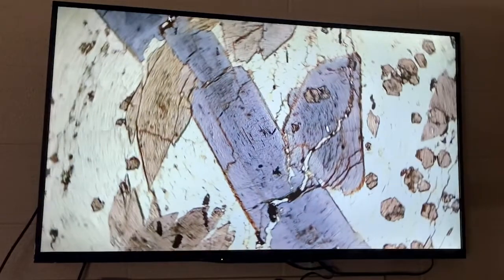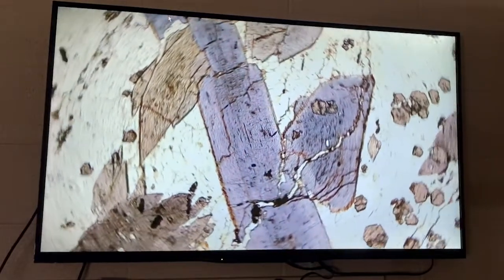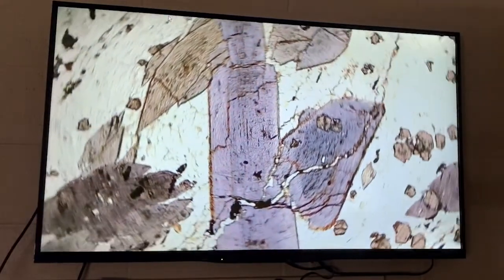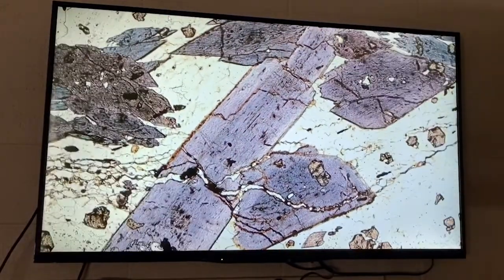Here we have the mineral glaucophane. Glaucophane is a common mineral found in metamorphic rocks. As you can see in plain polarized light, glaucophane appears to be a pale blue color.